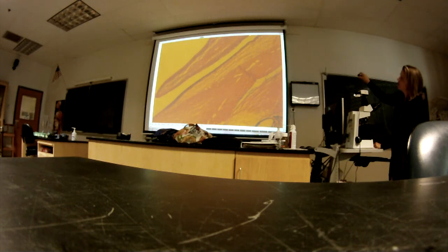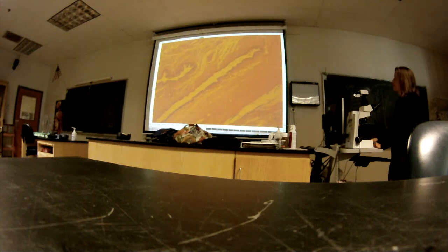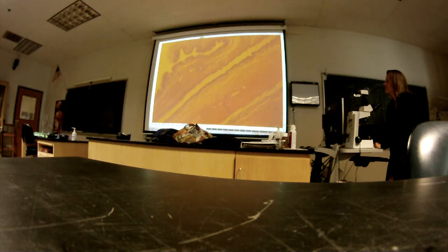Okay, so this is the eyelid, and so this is the ocular conjunctiva. You can see it goes up, and then you can follow it. Makes a little cul-de-sac, right? Okay, so let's get a little closer.